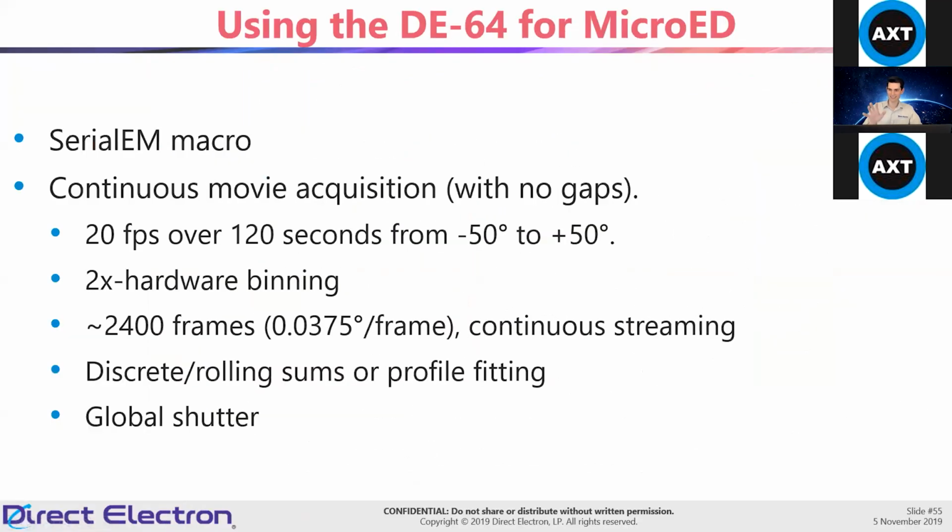The other part I wanted to talk about is how this data was collected. Of course, we used SerialEM to drive everything. This was also done with continuous tilt, so there's no stopping. We did a couple of things. This was about 20 frames per second for the entire movie. It's a 2-minute exposure from plus minus 50 degrees.